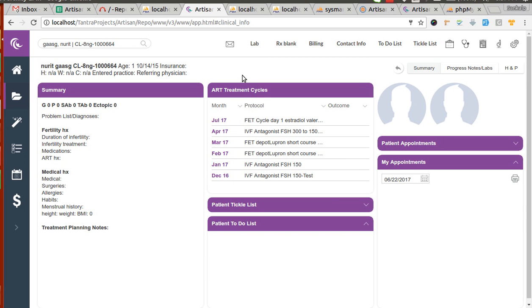So I made some changes in the lab notes. Here I am going to show this in this video. So for this patient I created some cycles. First I created a cycle in December month.